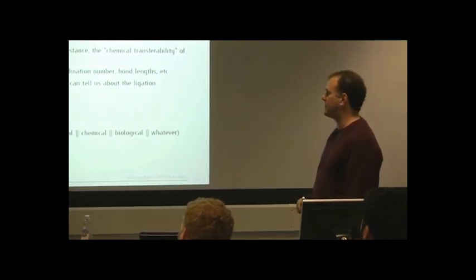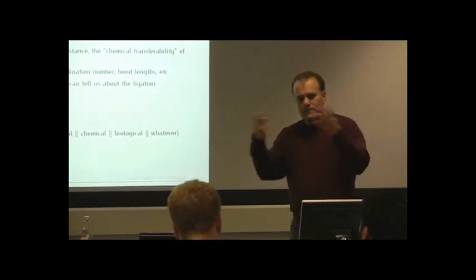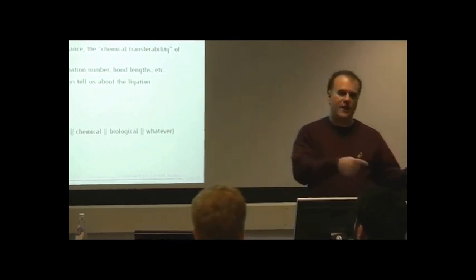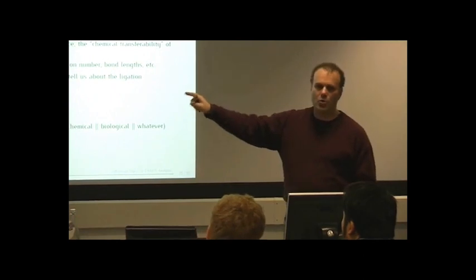You could then use that number as a decent approximation of S0 squared in the unknown sample, and thereby use that number to extract coordination number from the unknown sample.